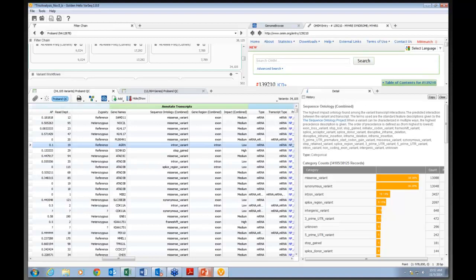Any specific modules for clinical mutation analysis? That's an interesting question. The entire software package is designed ultimately for use in a clinical setting. As time goes on, we will be adding more and more, shall we say, optimizations in that regard. But no, right now there are no specific modules that are the clinical versus, say, research.